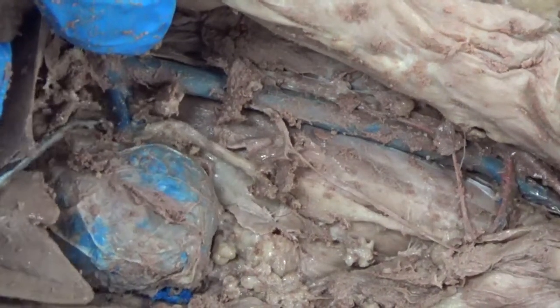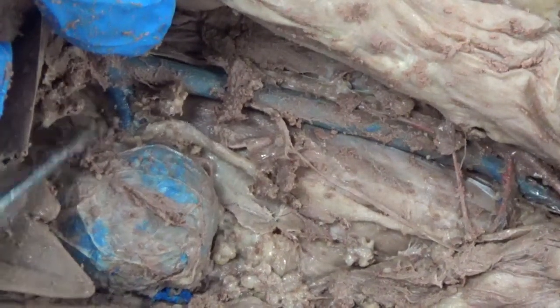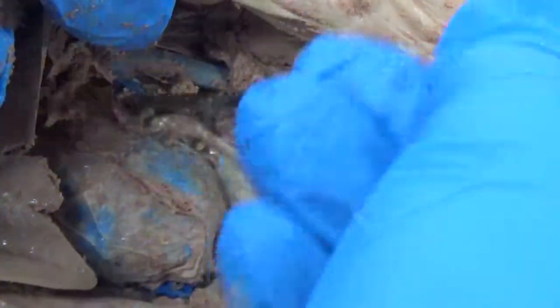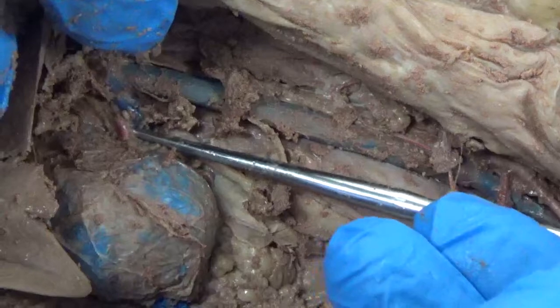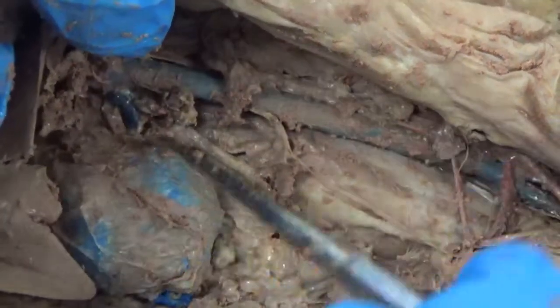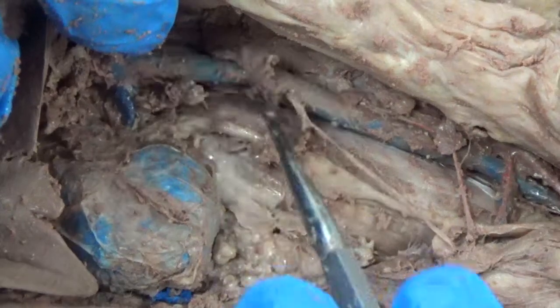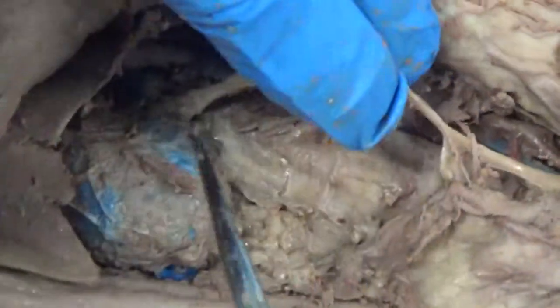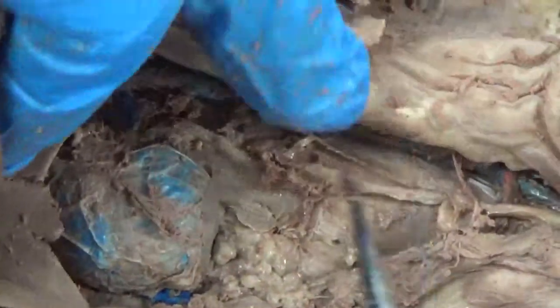And the renal artery is usually a little bit deeper, harder to see. But it's that pink thing right there. That's the renal artery. Okay, renal refers to kidney. This tube coming off of the hilus of the kidney is the ureter, and that goes all the way down, and then urine that's produced in the kidney travels down this to the bladder, to be stored temporarily.